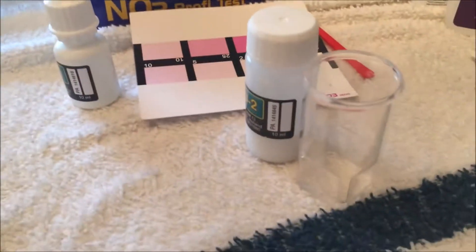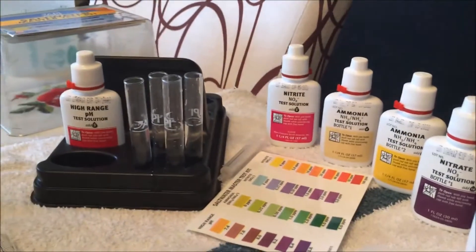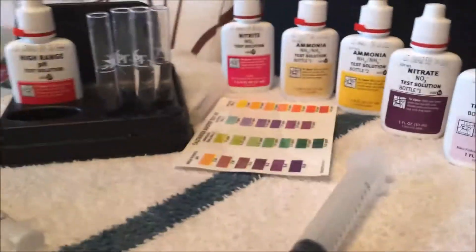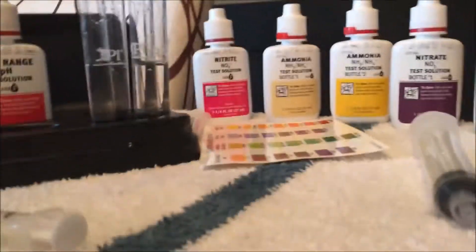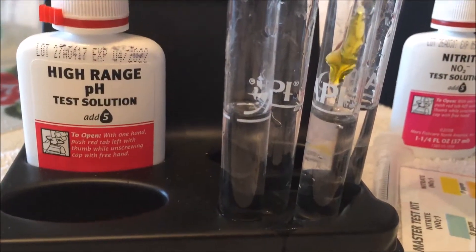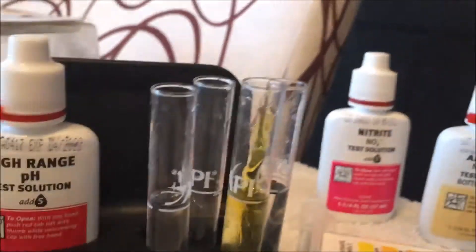I pre-washed everything and filled everything up with the same syringe that's brand new, haven't used it. So let's get to it - I'm going to test for nitrate, nitrite, and ammonia and see what we get. First one we're going to do is nitrate, and that's going to be 10 drops, so let's go ahead and add 10 drops into this first vial - and that's 10.